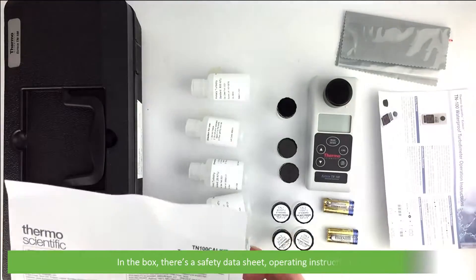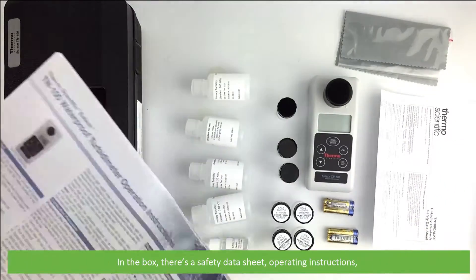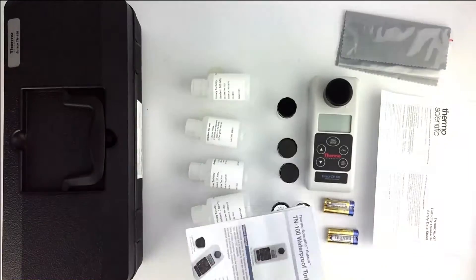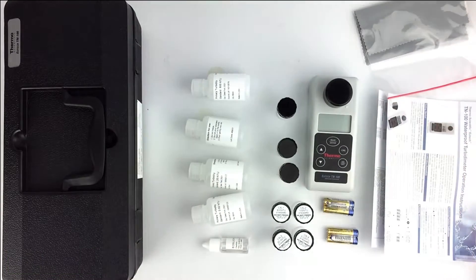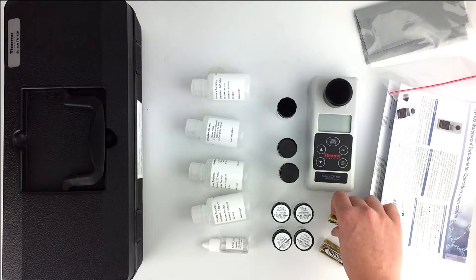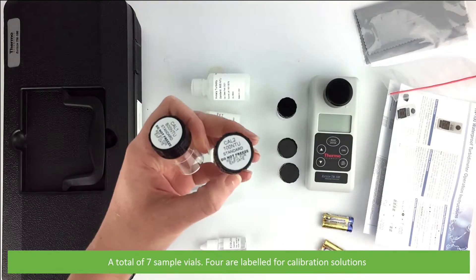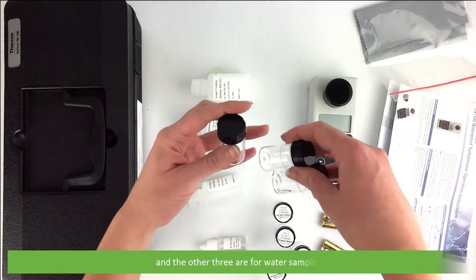In the box there's a safety data sheet, operating instructions, a lint-free cloth, four AAA batteries, and a total of seven sample vials — four are labeled for calibration solutions and the other three are for water samples.